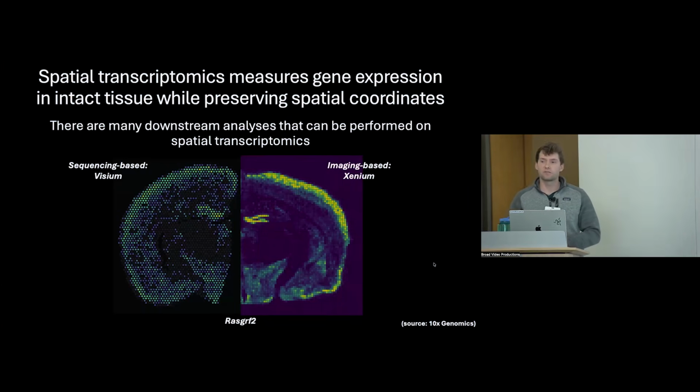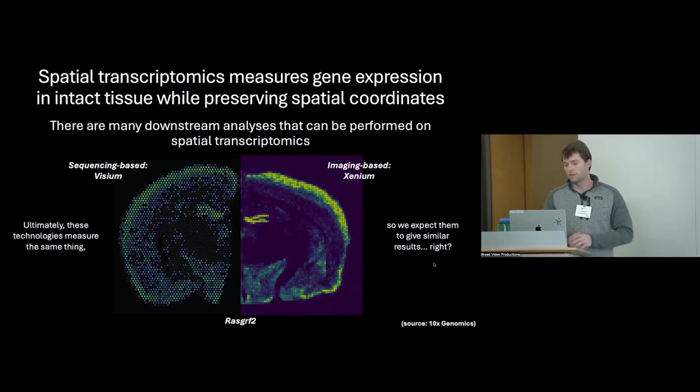There is a lot of downstream analysis that we can do with spatial transcriptomics. Dr. Fan will be talking a lot about what we've been doing in the lab to analyze this type of data. For me, I'll focus the next part of this talk on the differences between these two technologies, or really focusing on the Xenium technology.